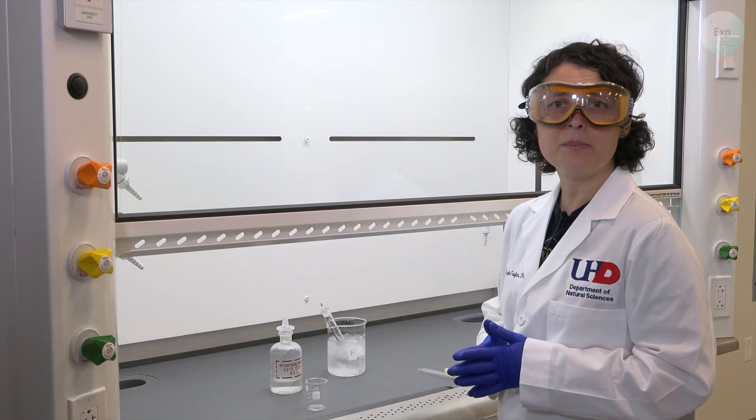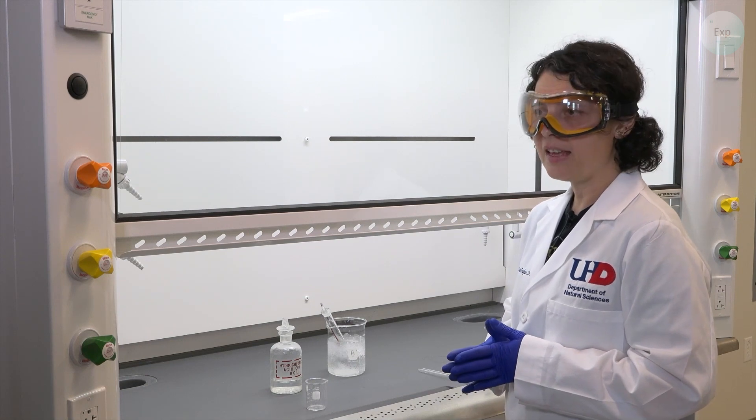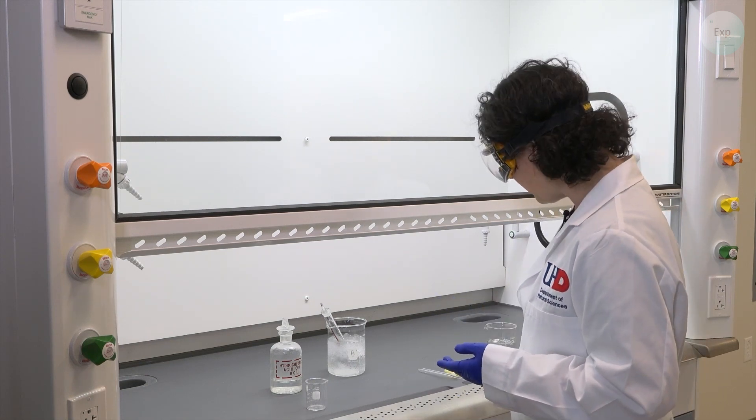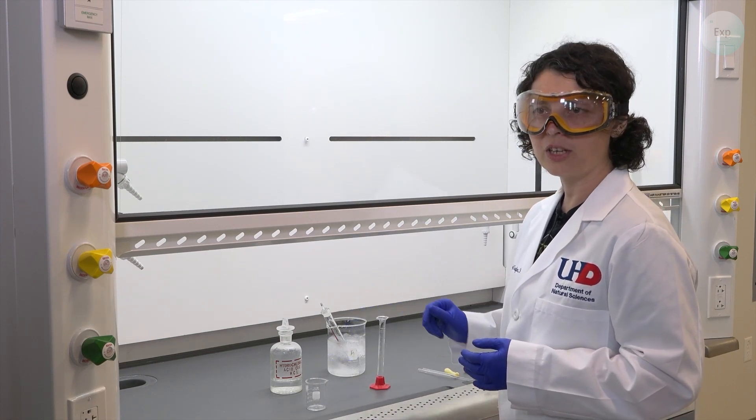The next thing is measuring the amount of concentrated hydrochloric acid that we're using. We will need 8.47 milliliters. And so for that, we will use a 10 milliliter graduated cylinder and a beaker from which the transfer will occur.